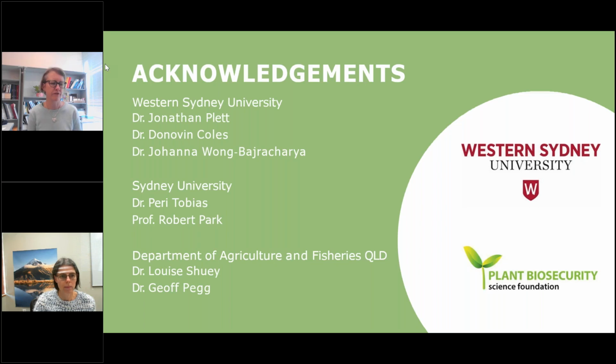Yeah, exactly. I guess one thing with metabolomics is that we have different mass specs and different ways that mass specs can run. So you could get variation across instruments. So you might have to develop your method specifically for the instrument that you have. Whereas with next-gen sequencing, I think there are different tools that you can use, but it's a little bit more standardized. But once you've got that out of the way, I think it's fairly straightforward.